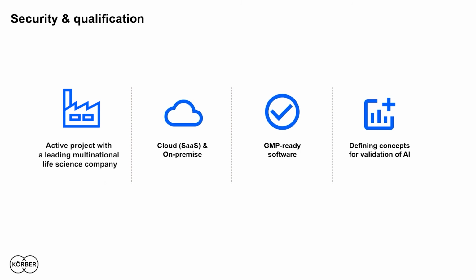And AI with Pharma is new for everyone, and right now we already have these new tools built into our software. So you can be the first to adhere to the new methods from these groups.